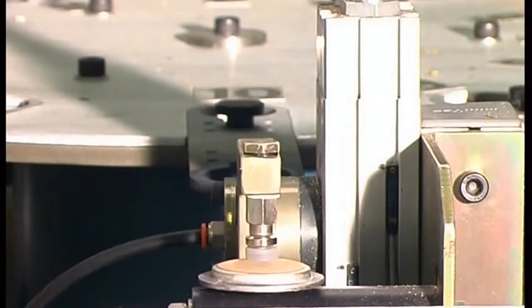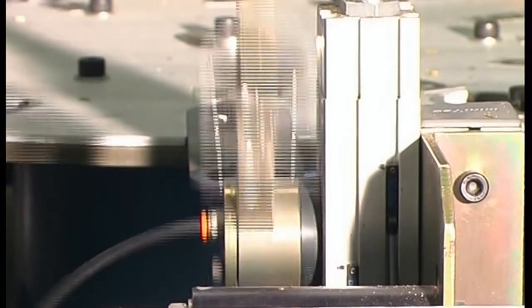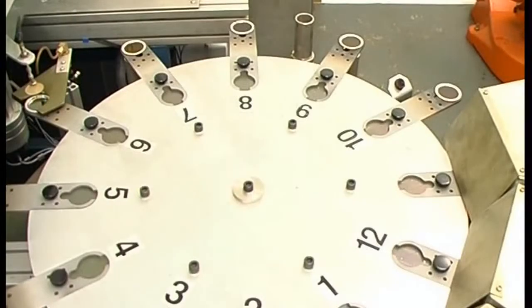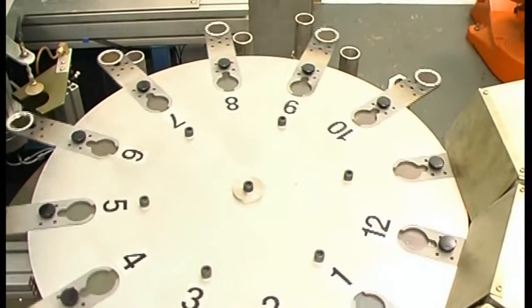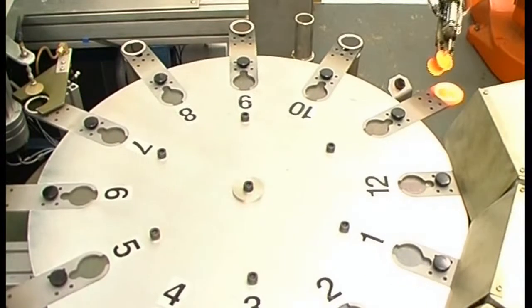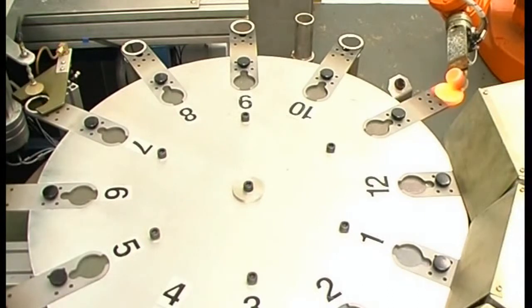Moulds are inverted to ensure there are no loose flux particles remaining, and they then pass through the preheating segments of the mould carousel to bring the temperature back up to a thousand degrees, ready for the next sample pouring.